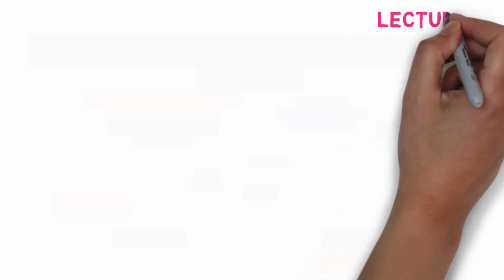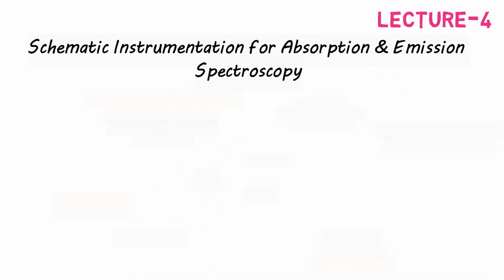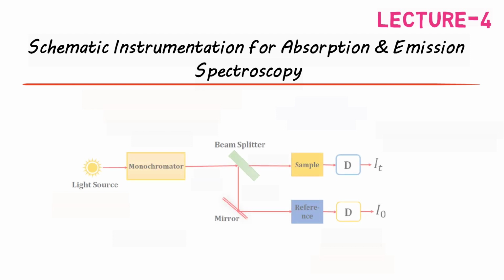Hello dear students, in this lecture we will talk about the schematic instrumentation for absorption and emission spectroscopy. The diagram that represents schematically the instrumentation of absorption spectroscopy is shown here.